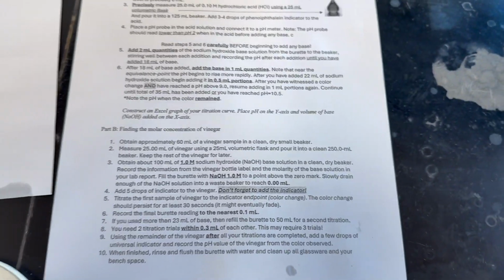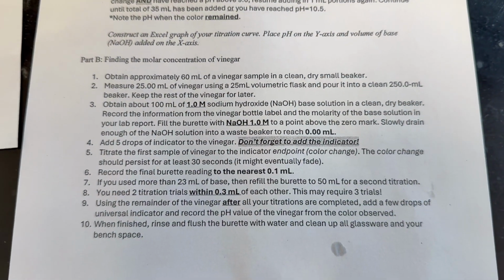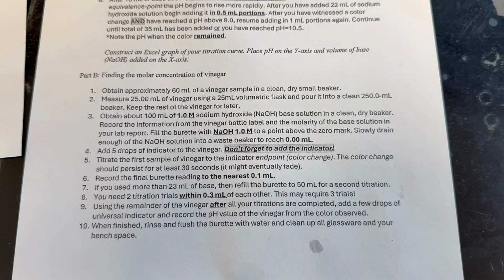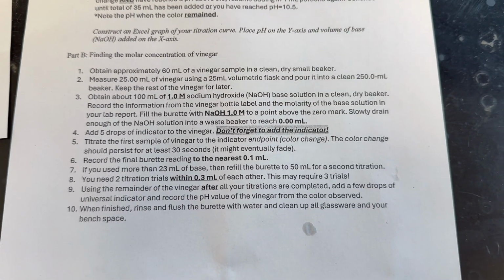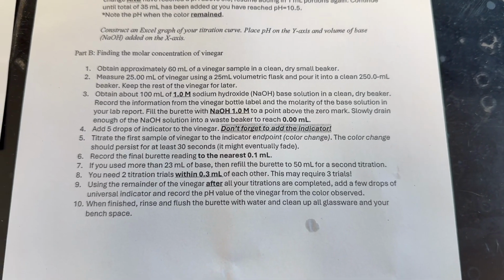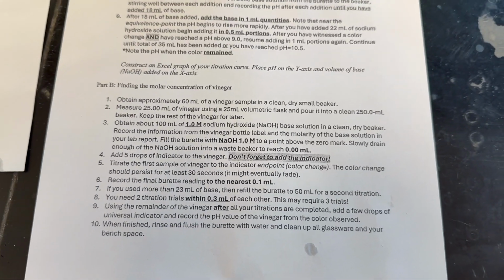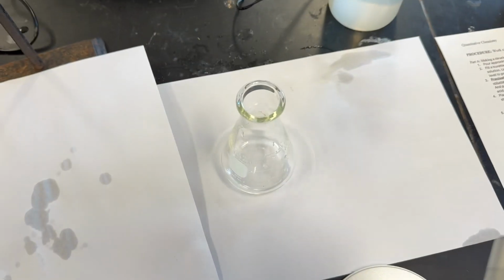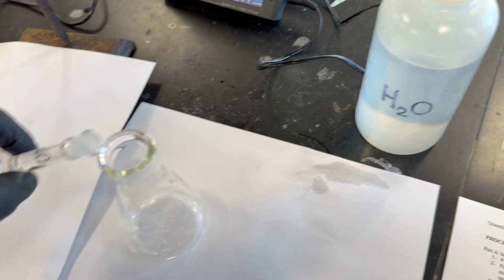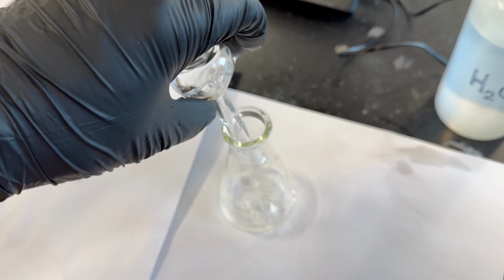And we're ready for the second part of the activity, which is the actual titration of the vinegar. To do that, we're using 1 molar sodium hydroxide this time. It was 0.1 in the first part of the lab, but this one is 1 molar NaOH, and still we're going to go with 25 milliliters of our vinegar, again carefully measured in a volumetric flask.